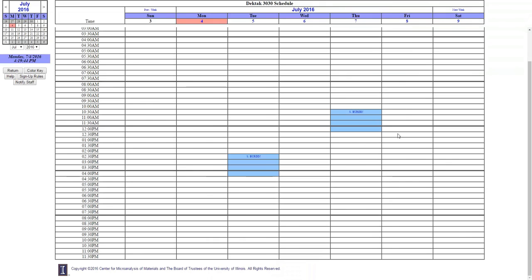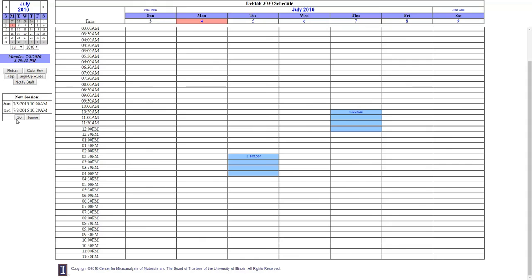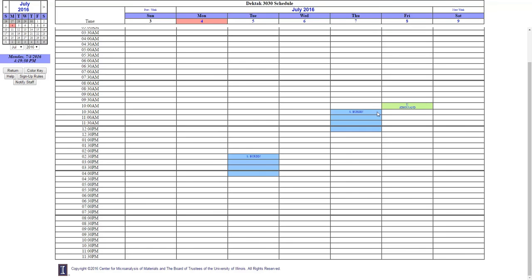To reserve time, you click on the time when you want to start, and you click on the time when you want to end, and then click Go. This will add you to the session.